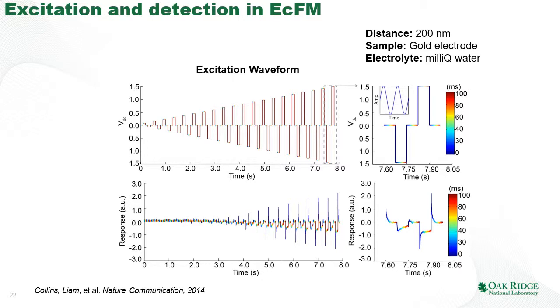And all of a sudden, you start to see a very interesting dynamic. For the small bias pulses, we don't have any response whatsoever. Application of the small bias pulses and then subsequent measurement using this AC waveform doesn't show any changes in our response. But for sufficiently large biases, we start to see that the system is pushed away from the equilibrium state, and we see the rapid relaxation.